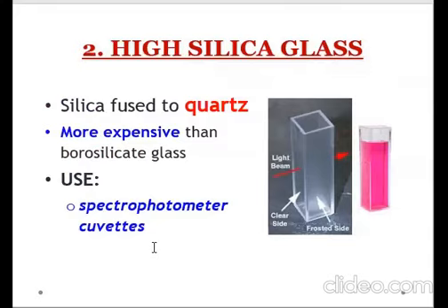So your high silica glass in the laboratory, no, in the clinical chemistry laboratory, can be fused to quartz, no, and it can be used now later on, no, as part of your cuvette. Okay, I hope you're familiar with cuvettes. This should be, or you should have encountered this one back in PMLS 1 pa, no, in your clinical chemistry na topic in PMLS 1.